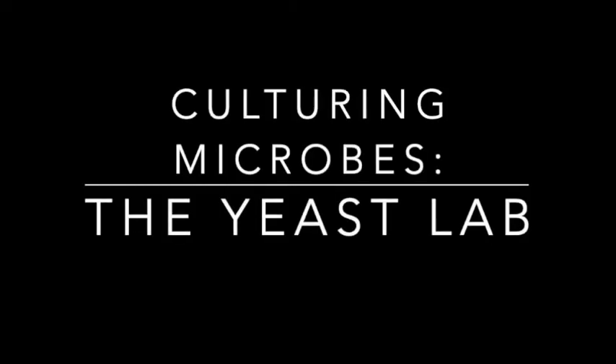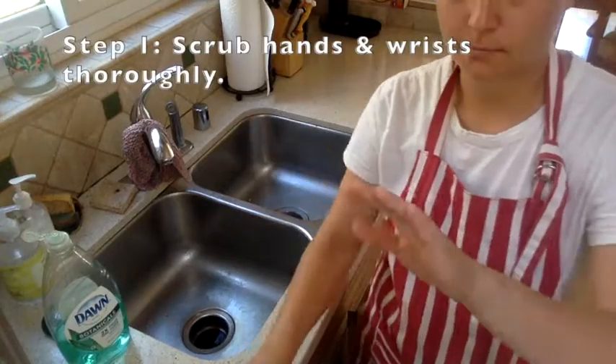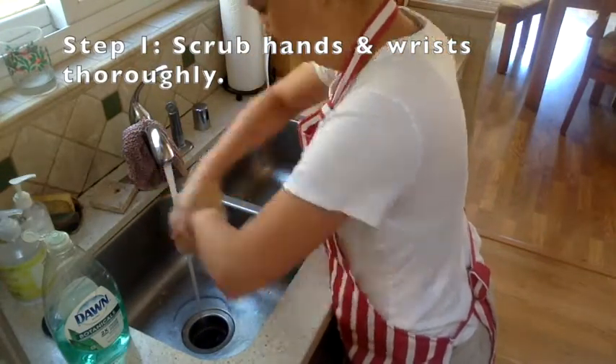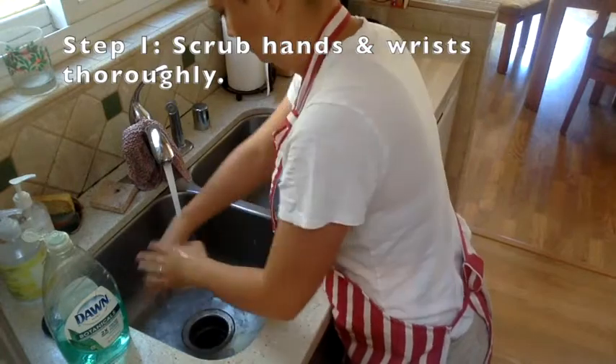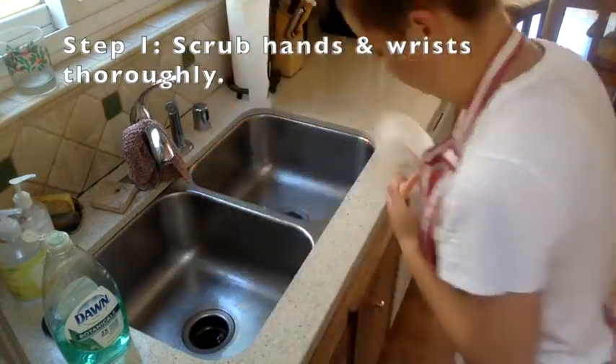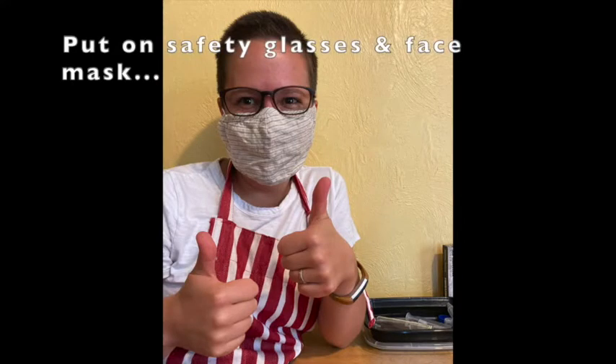Welcome to Culturing Microbes. This is the yeast lab. First step is to make sure that you scrub up. Wash your hands really well. You want to make sure that you don't get any contamination from your hands into your workspace.